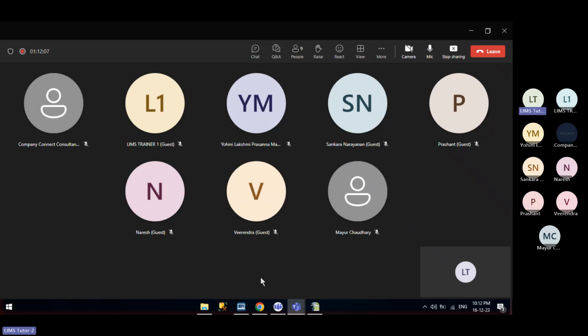However good the application is, if the master data is not properly configured, it will not work properly. You won't be able to execute your lot management, calibration, or stability management unless your static masters are manually configured properly. So master data configuration is a manual activity, and yes, it does take time.